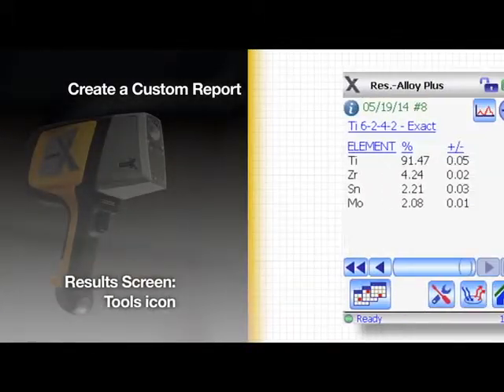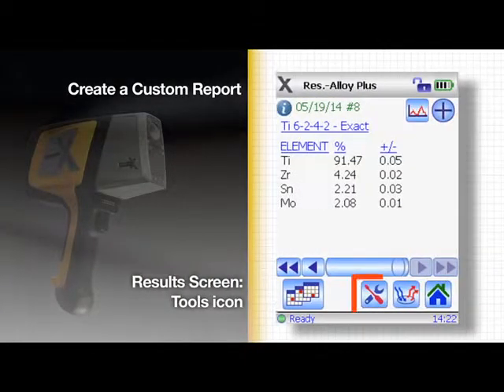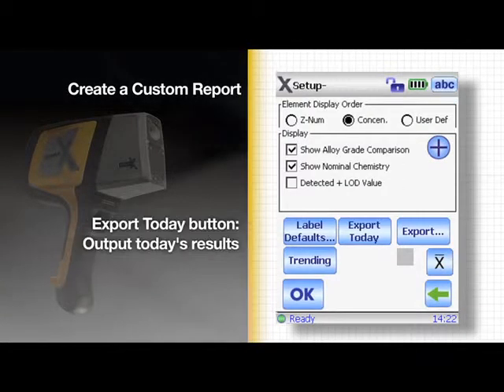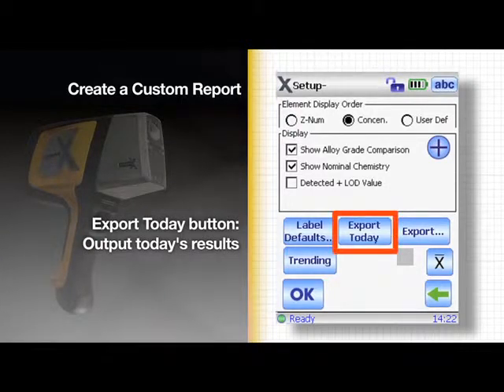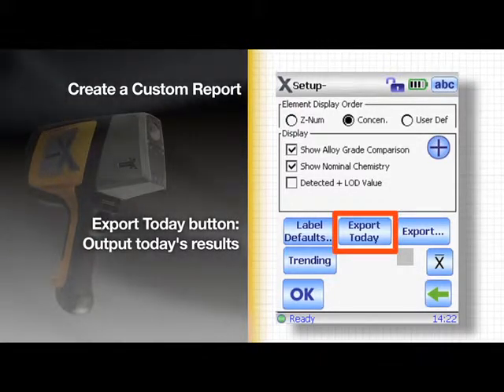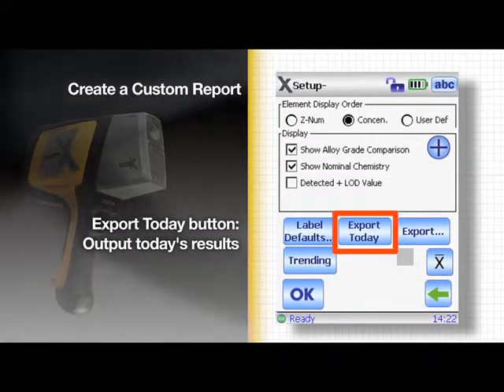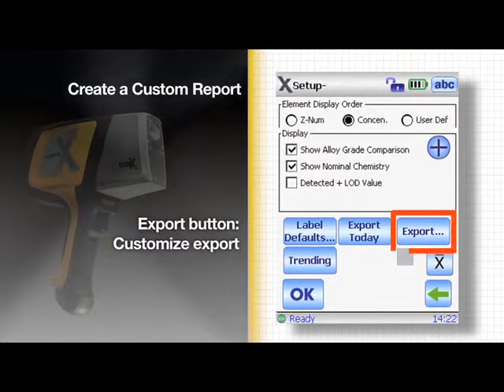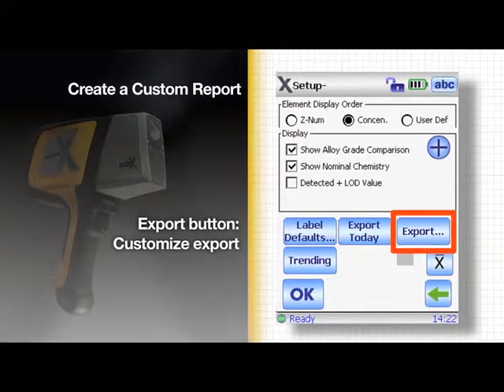The following example shows you how to create a custom report. On the results screen, tap the tool icon at the bottom of the screen. The export today button is a convenient shortcut to output today's test results. Tap the export button to customize.